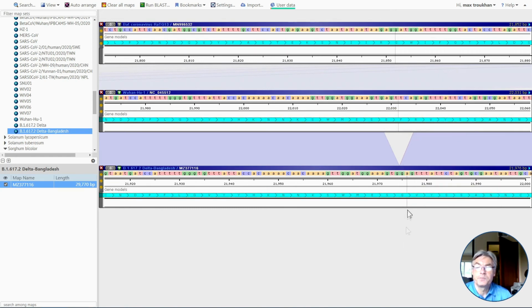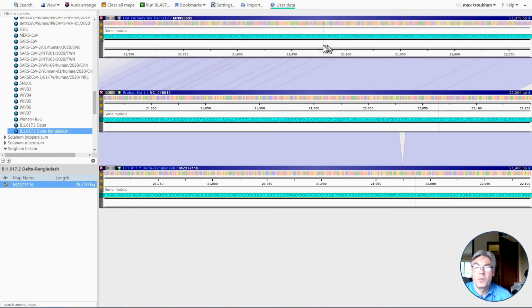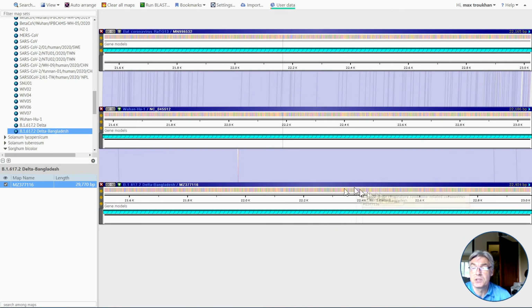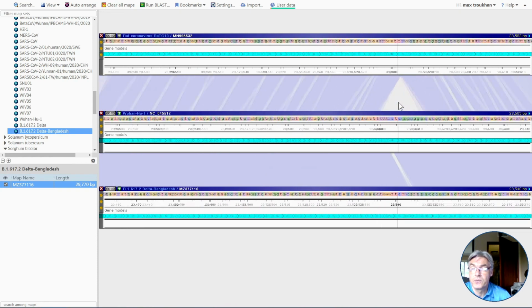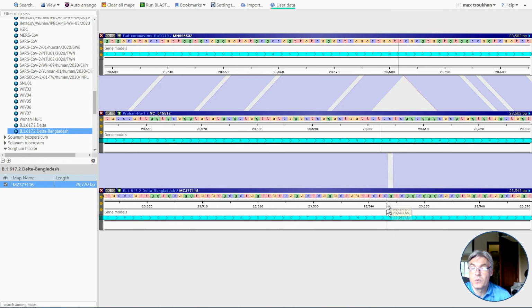Okay, and also we notice that when we compare the Wuhan version to the bat virus, there is also some mutation, insertion or deletion. It is somewhere here. Yes, here. This is the notorious furin site. You see this PRRARS. This is the one. So when you compare the old one, it didn't have it.